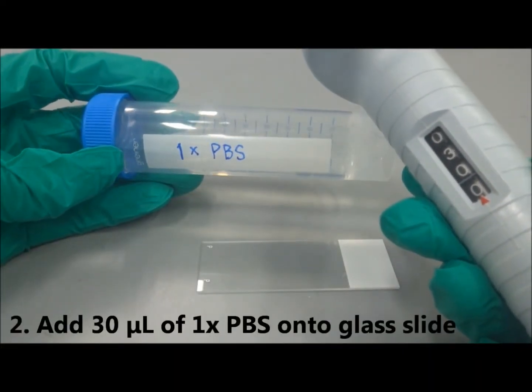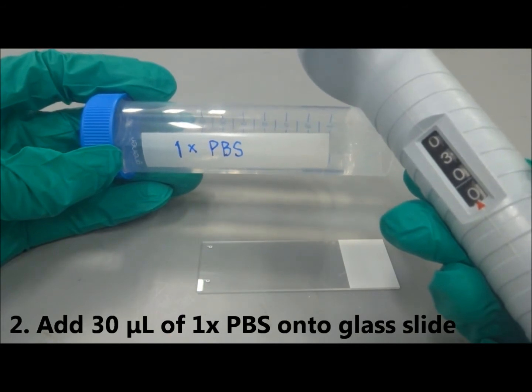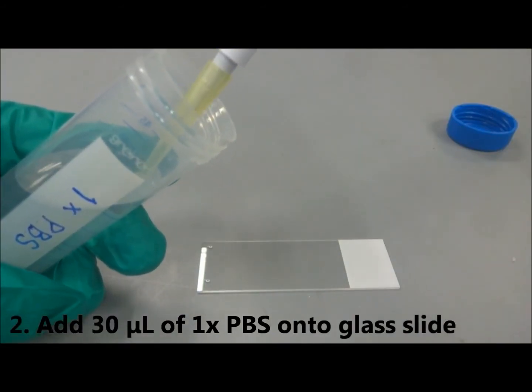Next, add 30 microliters of 1x PBS buffer solution to the middle of the slide.